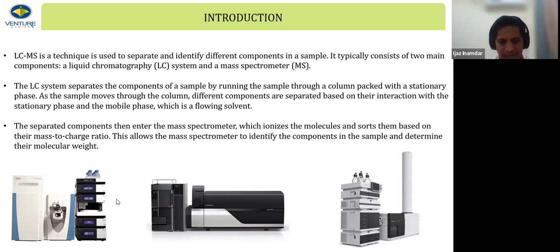But these are some of the vendors and some of the typical setups that are currently in the market. The middle one you see is the triple quadrupole by Shimadzu. There are other vendors also, but just for the sake of giving you a brief idea of how the equipment looks like and what is the setup, I have included these things.